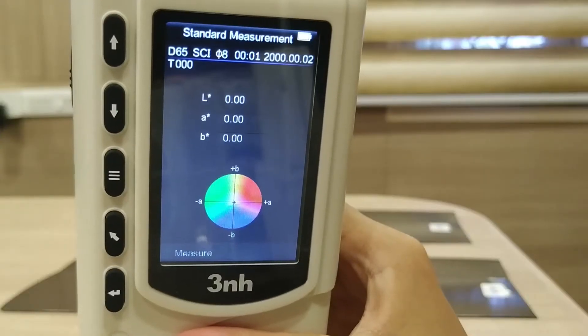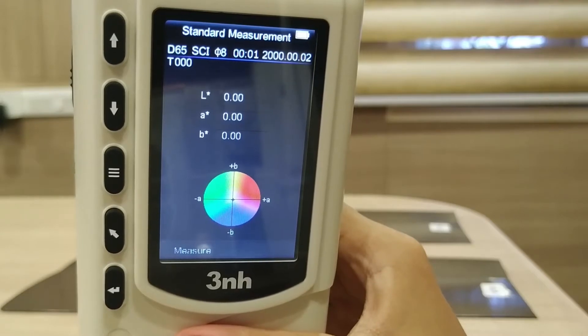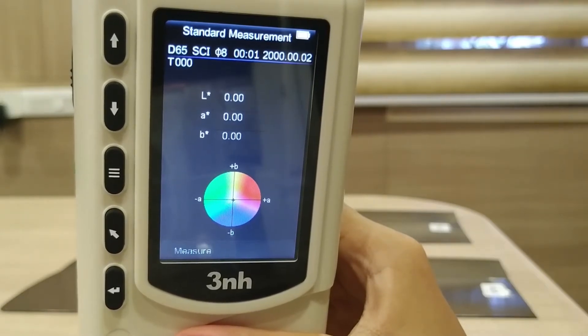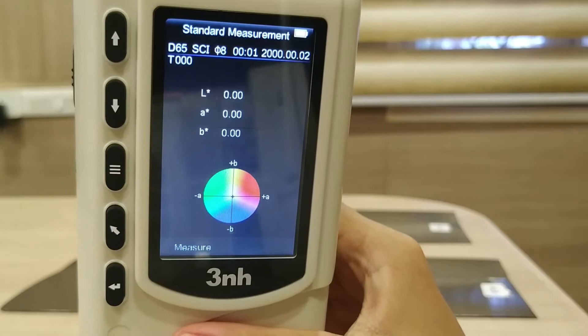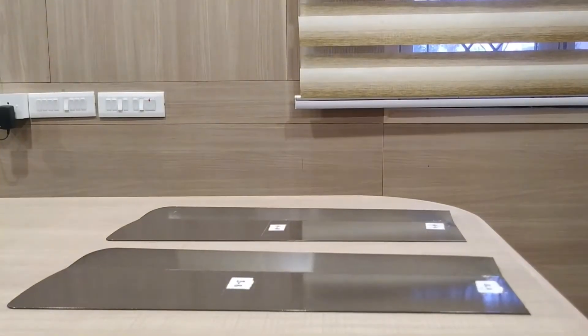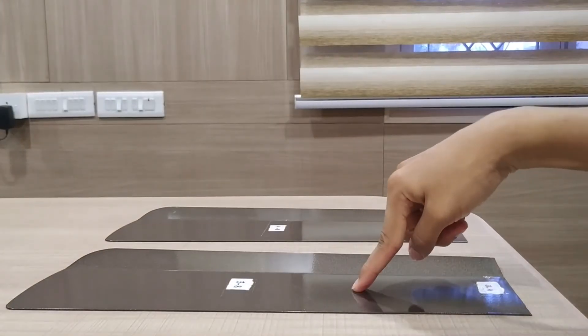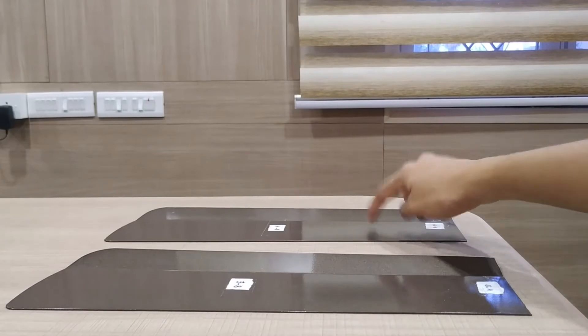I'm going to demonstrate how to conduct a color test between a standard and a sample. Here we have our standard and I'm going to use this as the sample.